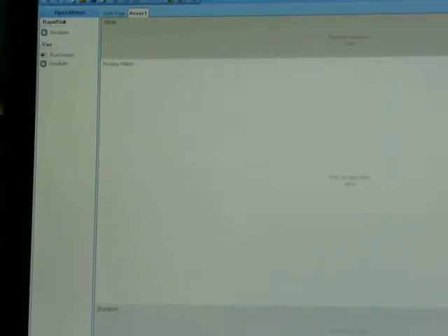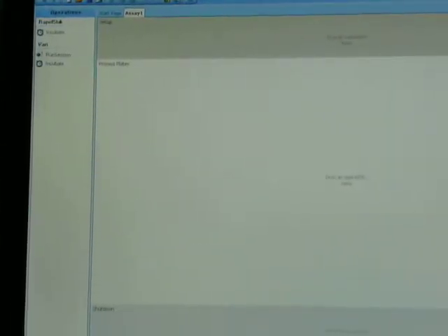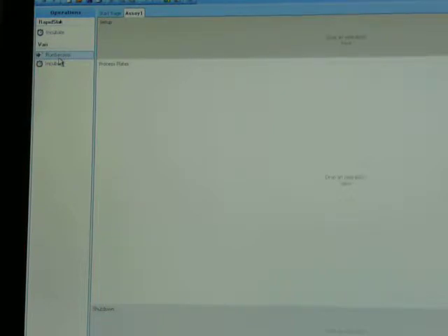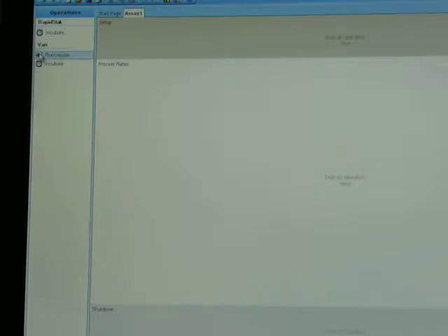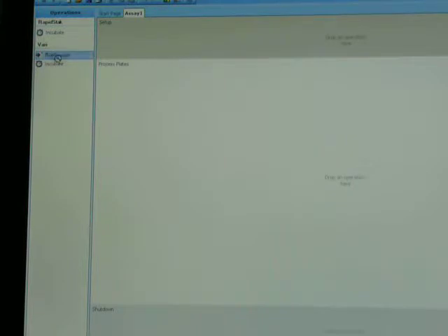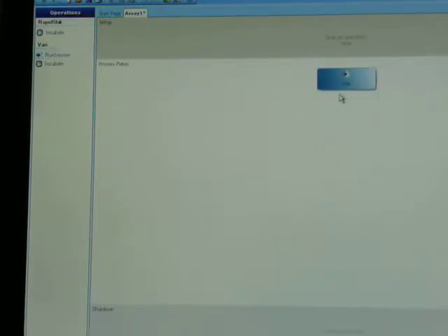What we have here is the working area of Polara RS. On the far left hand side, we have the functionality of the RapidStack and the VarioScan that we can drag and drop into our process editor. I'm just going to pull run session over into the center of the screen.